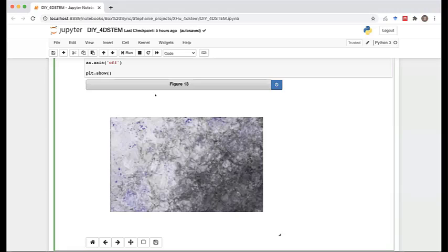Okay, yeah, that's good. And then I guess to add to that, we have prepared the data beforehand so you can run this faster. And as you can see here in Stephanie's demonstration, you do get a lot of information even after binning the original data. The original data, if I remember correctly, was somewhere around 8 GB. So 8. Yeah, that makes sense because it was binned. Yeah, it was binned by 8, right? Yeah, and it's 1 GB. There you can run it. It runs pretty well on any standard laptop.